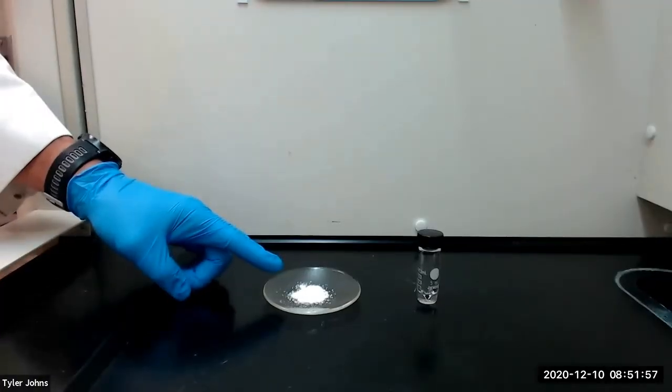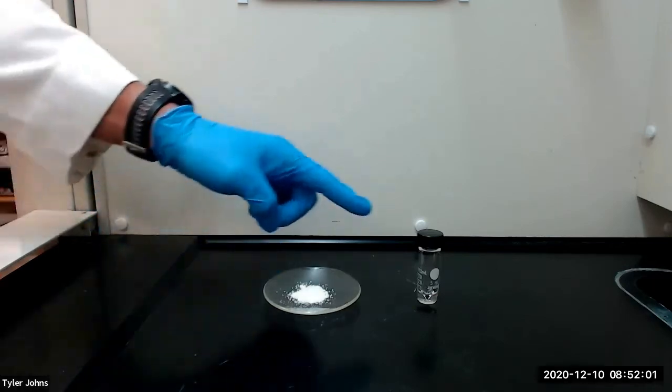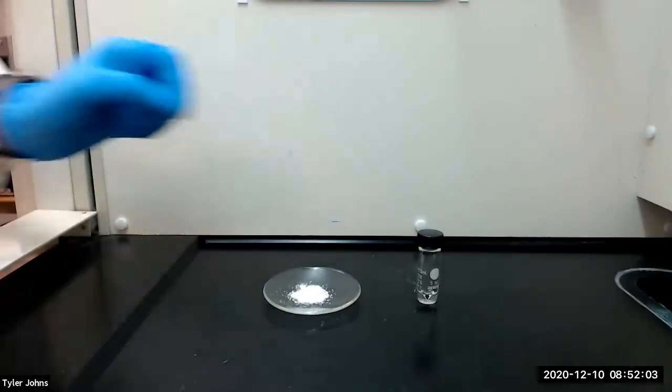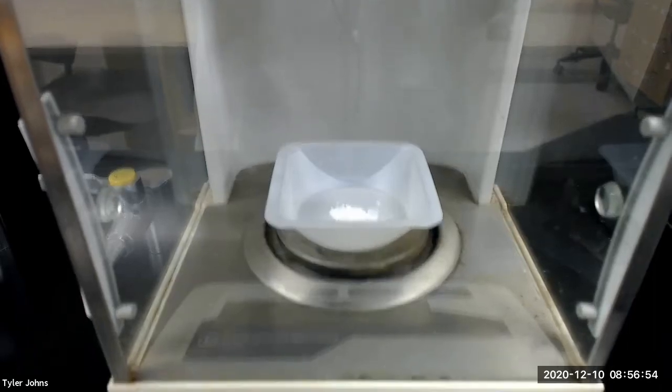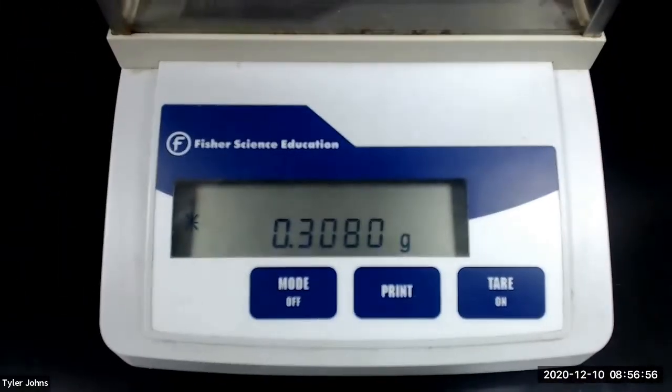To begin, we will add approximately 0.3 grams of the benzoin product from part A to a 5 milliliter conical vial. The mass of benzoin that we will be using is 0.3080 grams.